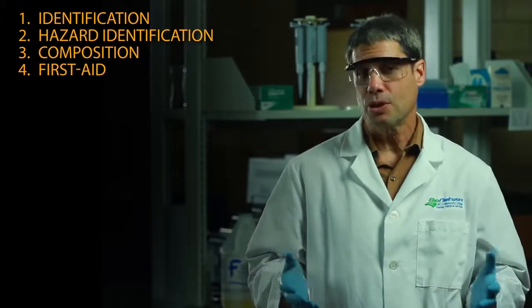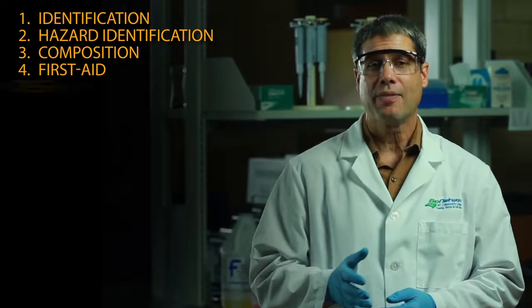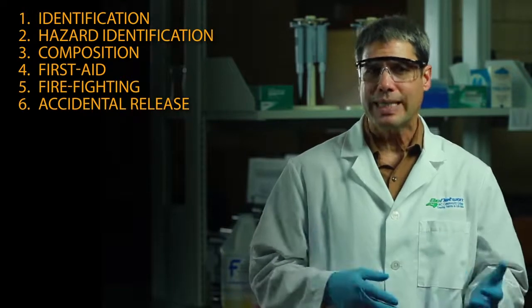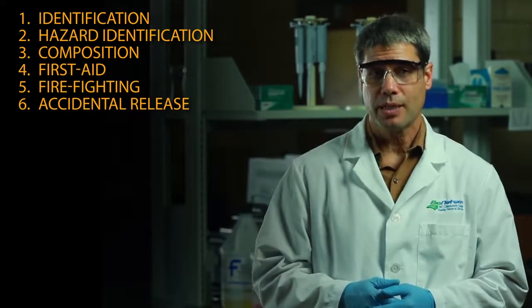Section 3, Composition, a list of ingredients. Section 4, First aid measures. What's the required treatment for a person who's been exposed? Section 5, Firefighting measures. Section 6, Accidental release measures. These are instructions for containment and cleanup of spills or leaks.